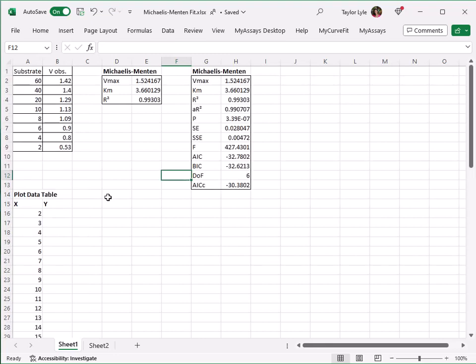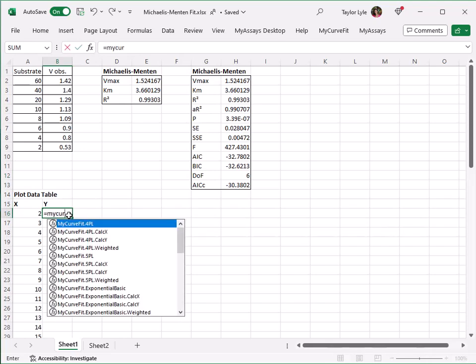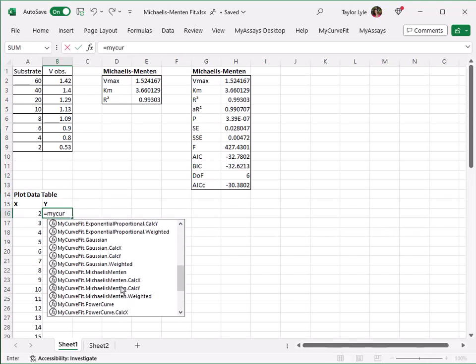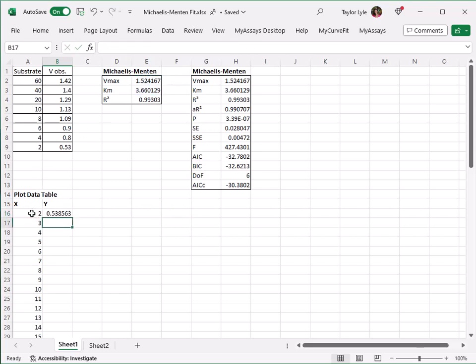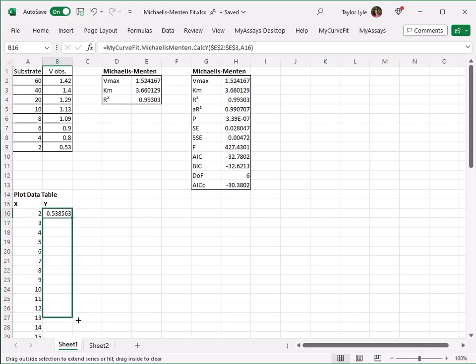Next, I'll calculate the Y values corresponding to these X values by entering equals MyCurveFit and selecting the Michaelis-Menten CalcY option. I'll select the Vmax and Km values and press F4 to add dollar signs to denote this selection as an absolute reference. Next, I'll select the X value and press Enter. Because I designated the calculated parameters as an absolute reference, I can drag this formula down the remainder of the plot data table.